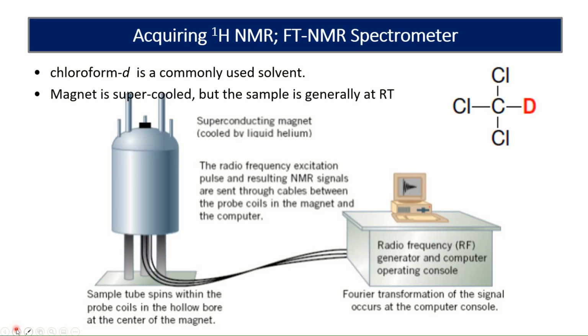This is a typical spectrometer instrument that we use for acquiring the proton spectrum. We usually have a sample in deuterated chloroform because deuterium is diamagnetic, and so it does not get in the way of you analyzing your protons. We have a tank filled with liquid nitrogen surrounding liquid helium, i.e. cooling liquid helium, which in turn cools superconducting magnets.